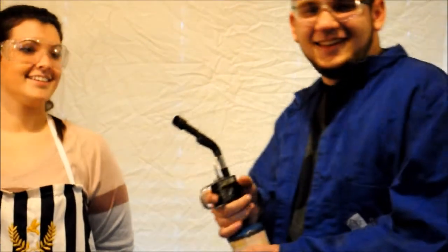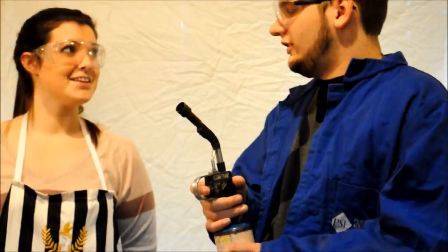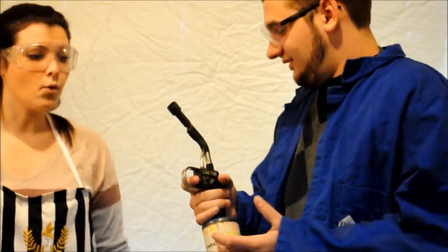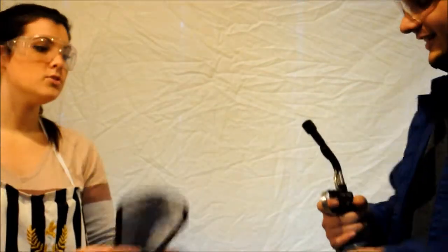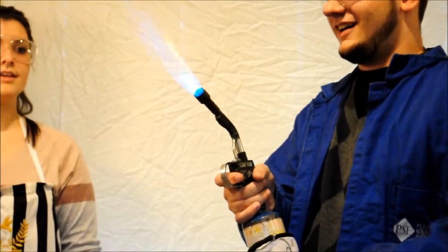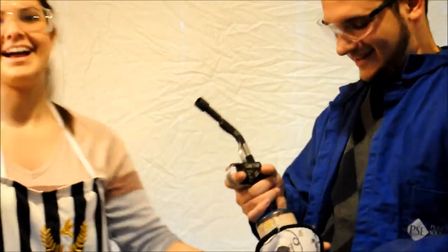Dexter, come on in. Dexter! Huh? No! What are you doing? No. Not only are you not using a hot hand, but you need to keep this away from people. Let's try that again. Use a hot hand. Much better. Now you look like you're ready to start using some fire.